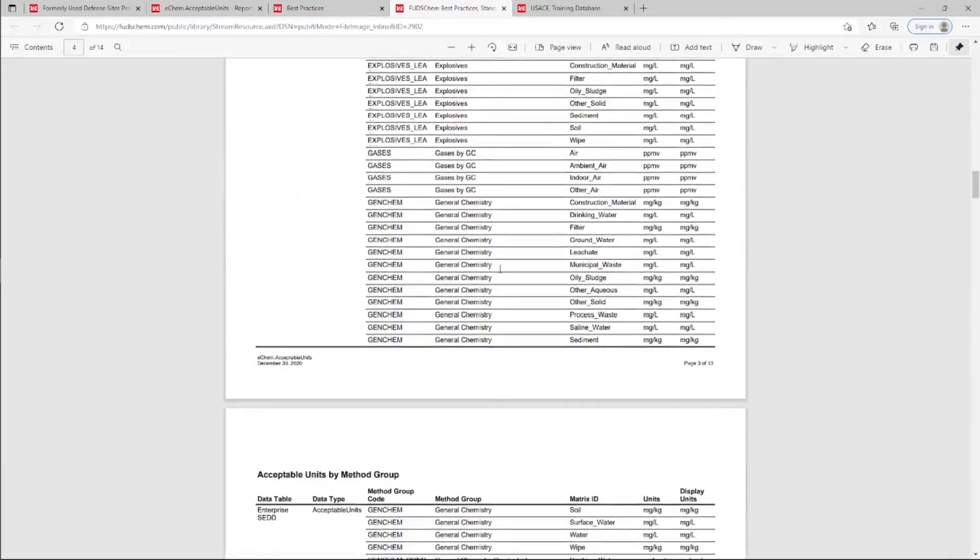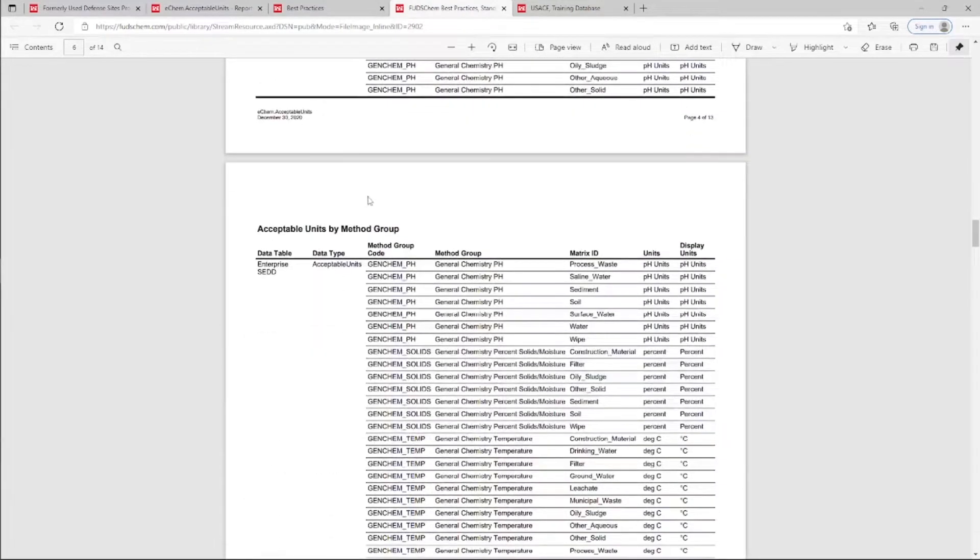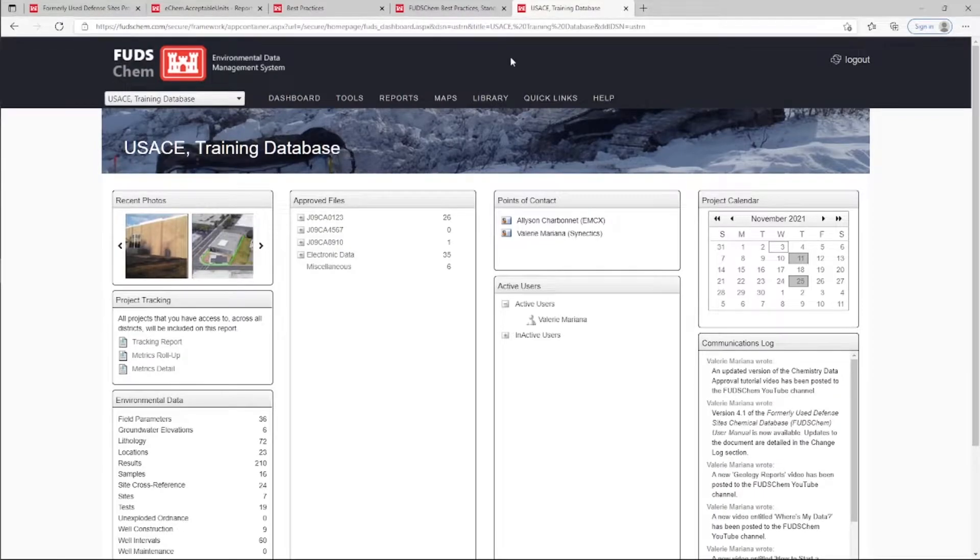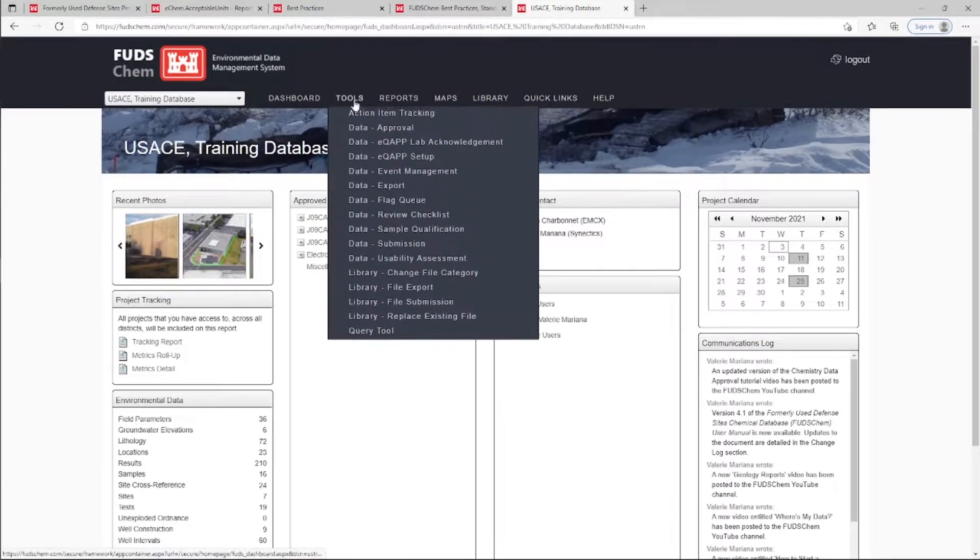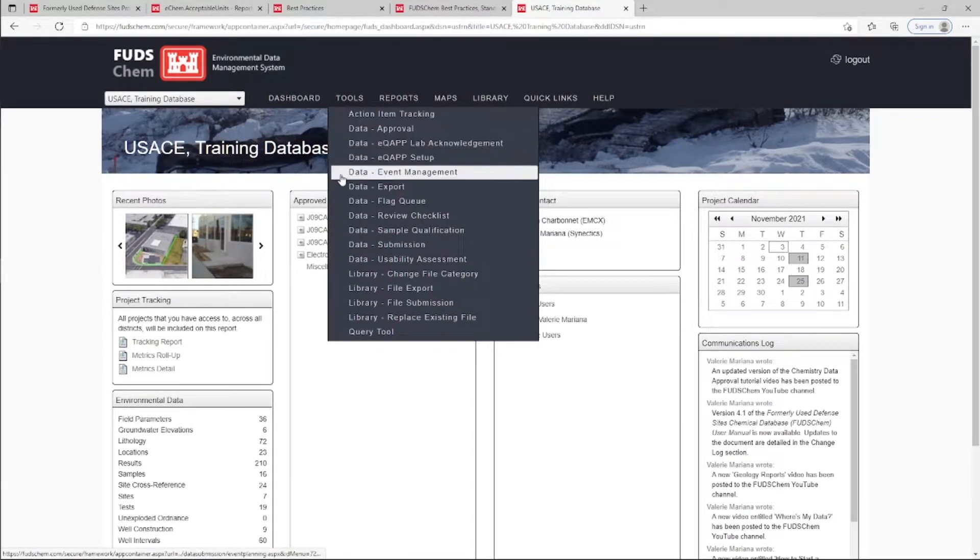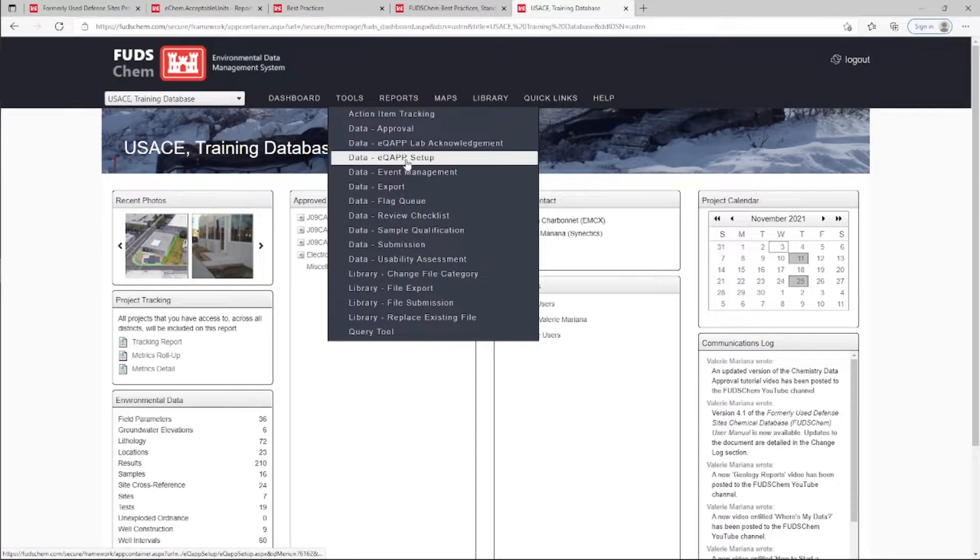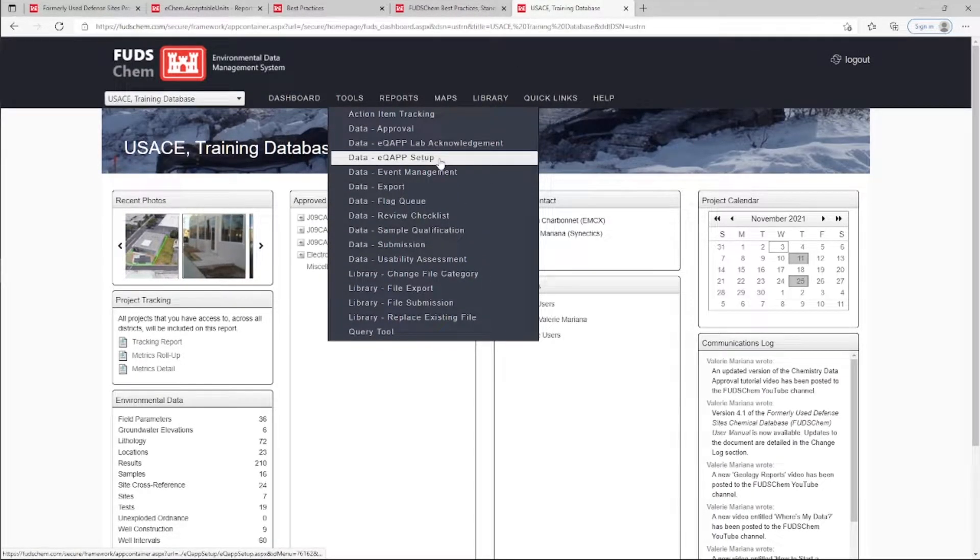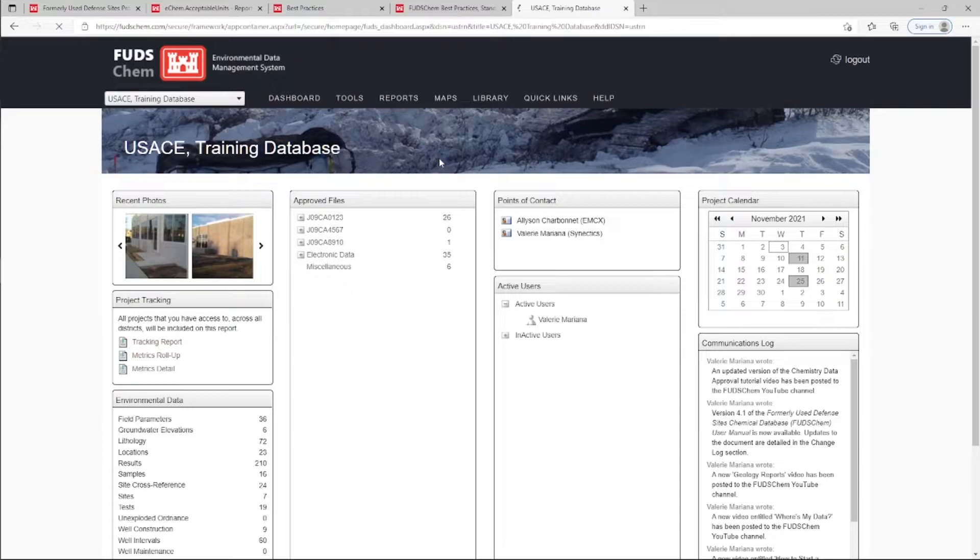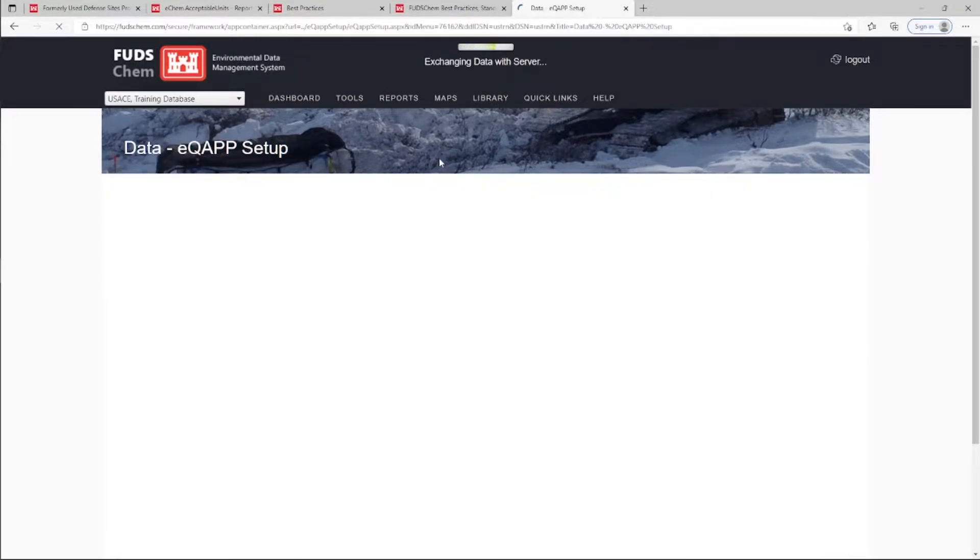Back in the database, under Tools, Data, EQUAP Setup, the user can add method templates to their EQUAP in the CopyQUAP tab.